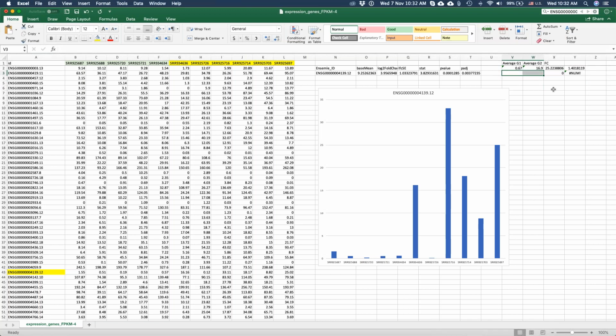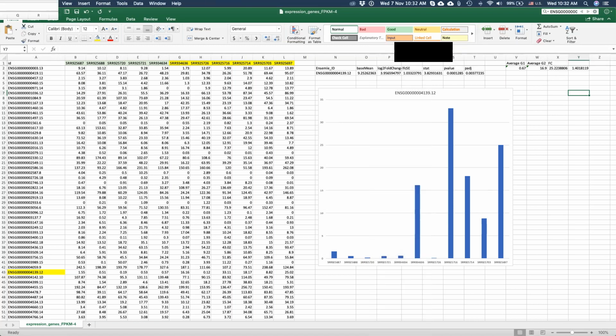So we can delete this. Okay. So actually, we now see the log fold change was 3.95, right? And the p-value was very good, and the p-adjusted value is even really good. So this is actually a good representation of differentially expressed genes.